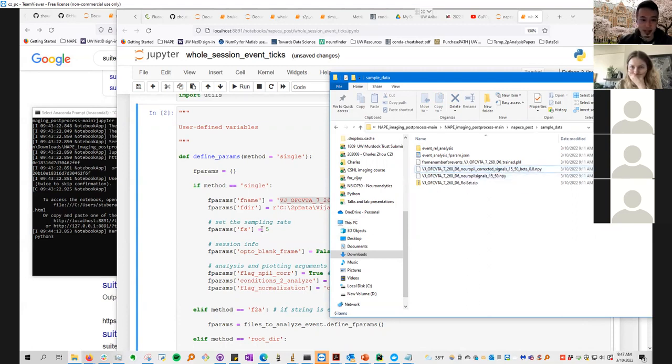That comes a step before all these scripts, because the data coming off of Inscopix recordings and the Inscopix preprocessing pipeline, as well as the data coming out of the Suite2P pipeline, might be in a different format than what this code immediately wants.